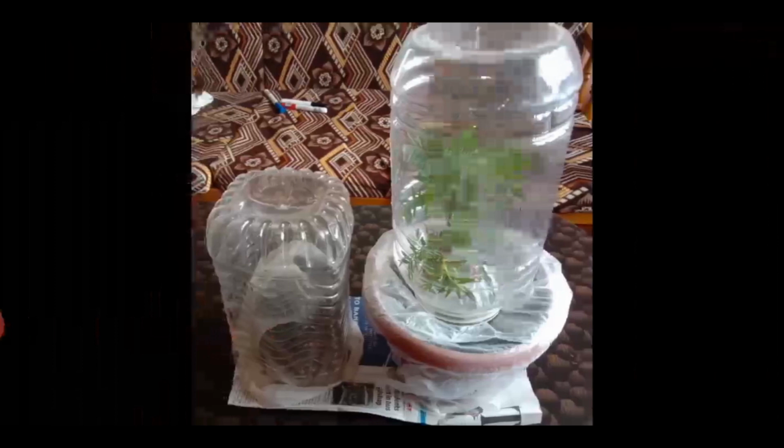Then the fourth step is to use Vaseline at the edges of the 2 bell jars such that it does not allow air to pass through, so it becomes airtight. No air should pass through it. After covering it with a bell jar, we need to leave the pots in the sun. The fifth step is to place the 2 setups under the sun for a few hours. Then after that we need to observe it.